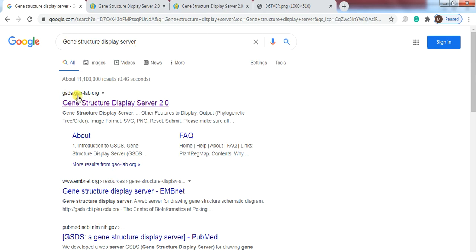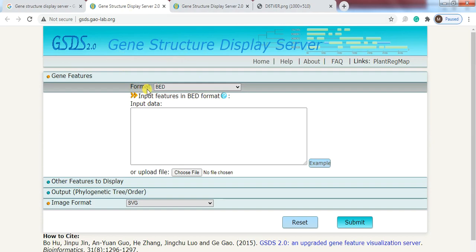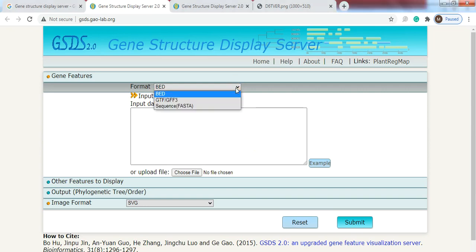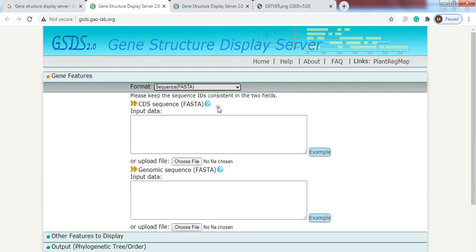This window will open. So here select the format that which sequence format you want to use. So we have the files in FASTA format so we change this format into FASTA.